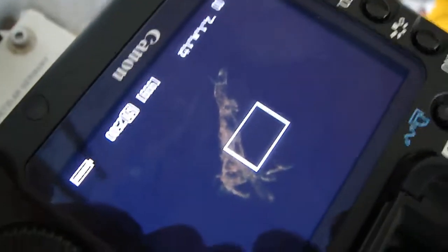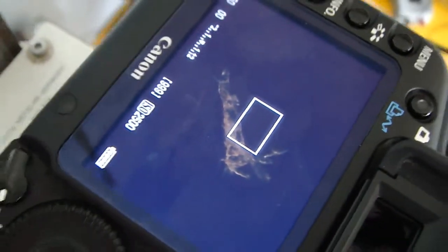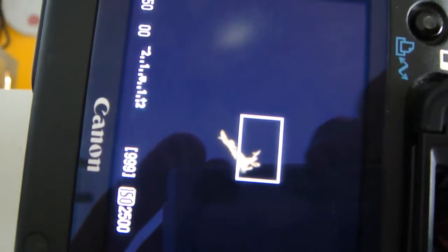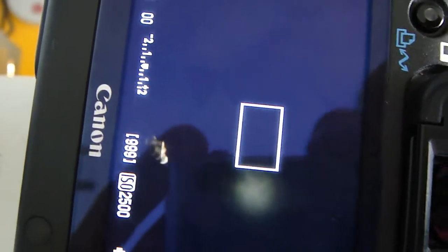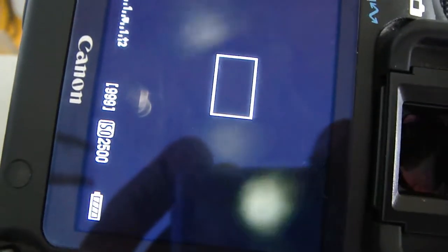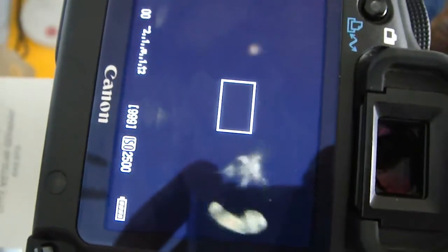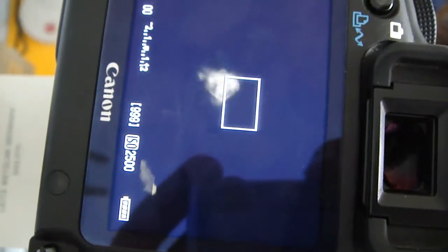Let's take a look. A little dust particle. But maybe we can enlarge it or make it more small. There it is. There we have some bristle worms. Barnacle larvae.